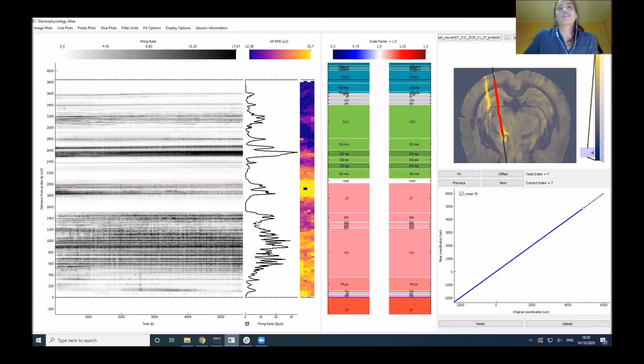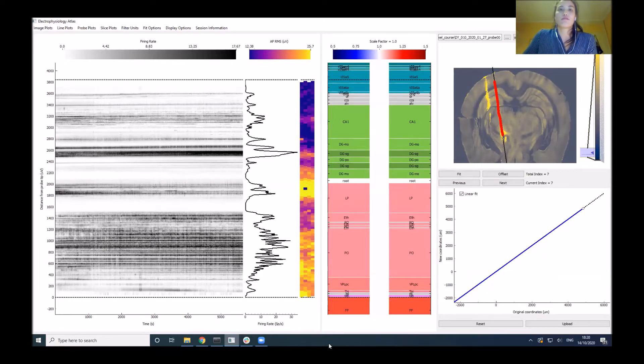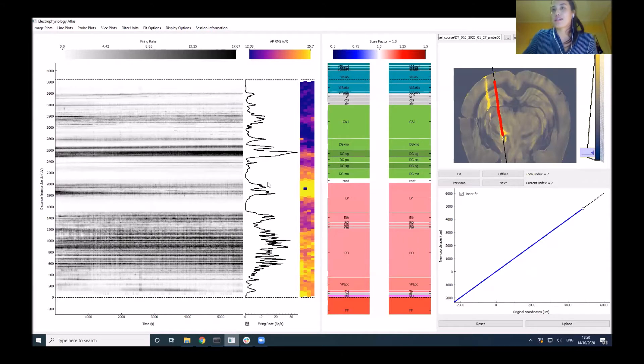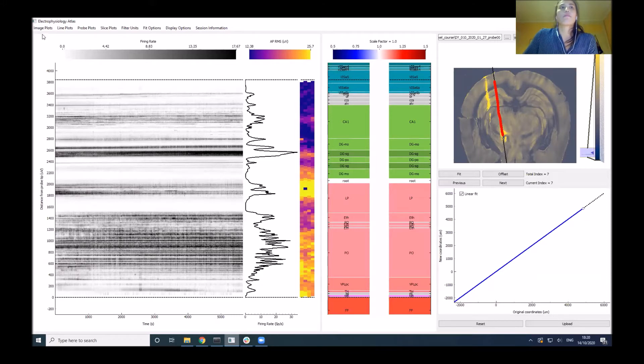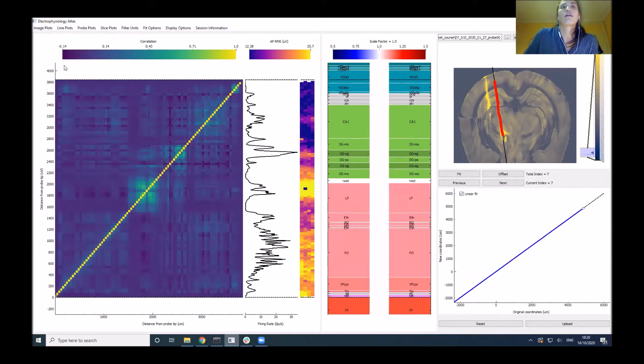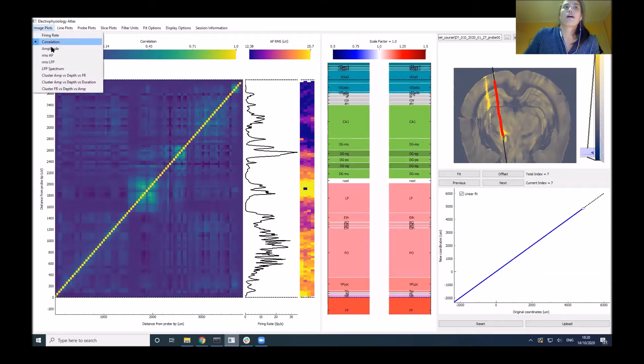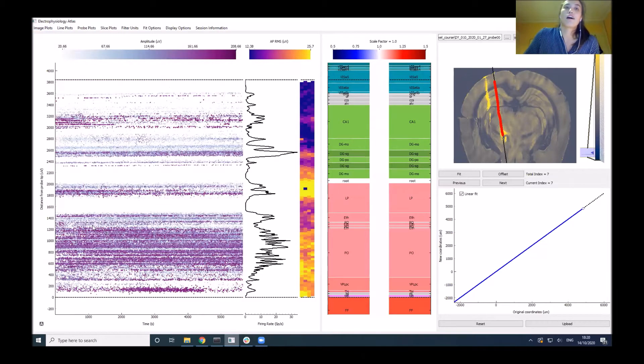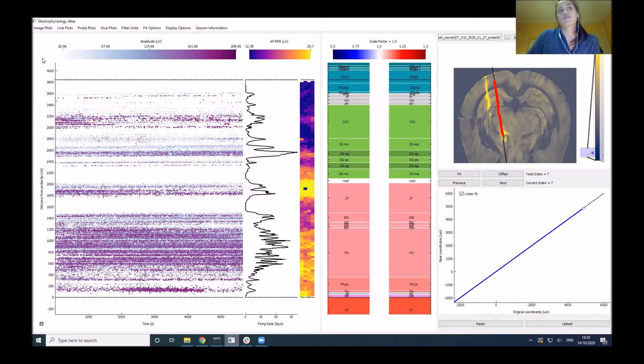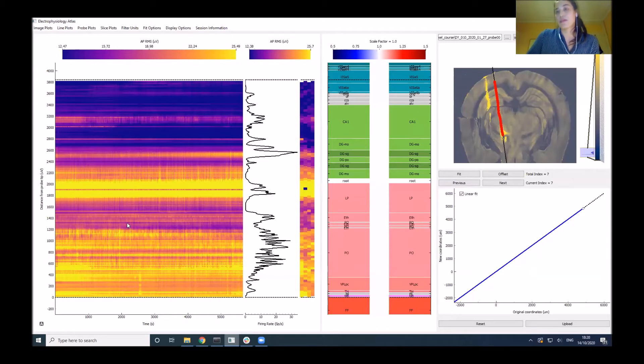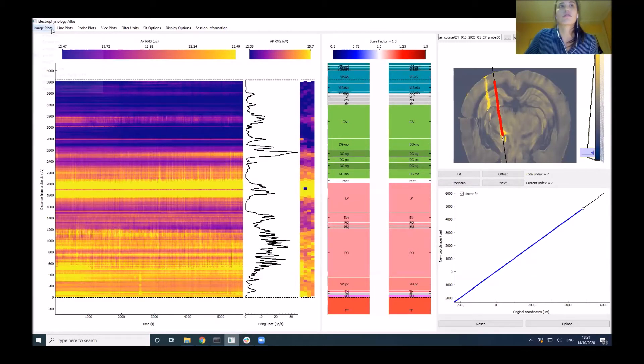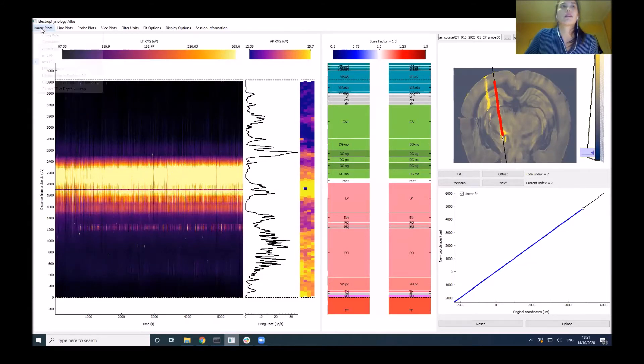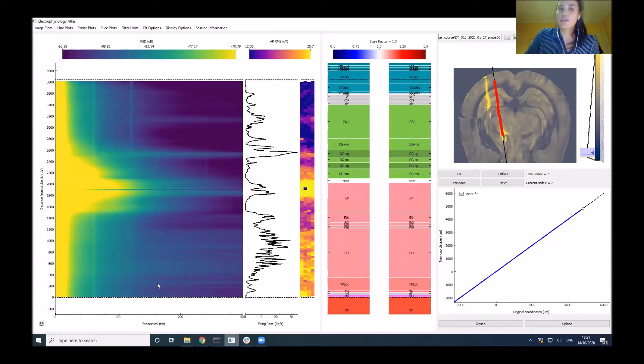Once you load in the data, this will be the first display. The tool is split into two columns. On this side, we have the electrophysiology features, split into three different columns. You have these image plots with a number of different features. There's the firing rate, cross correlation with depth, amplitude of spikes across the duration of recording, RMS signal of the AP band greater than 250 hertz across the recording, and a similar one for the LFP band for low frequencies.